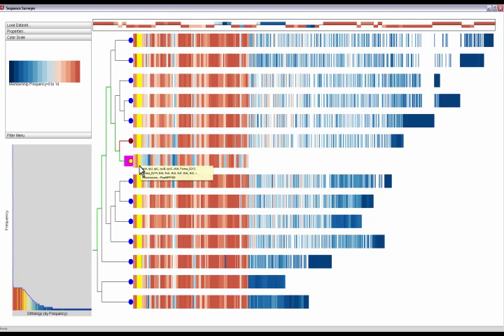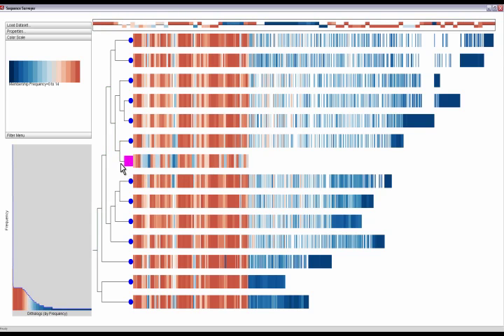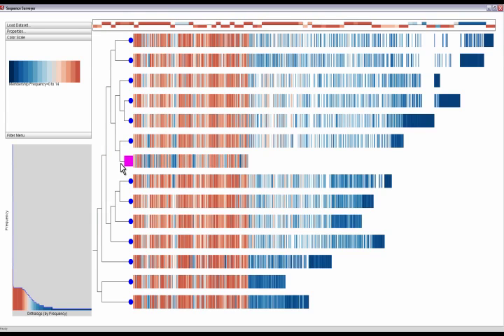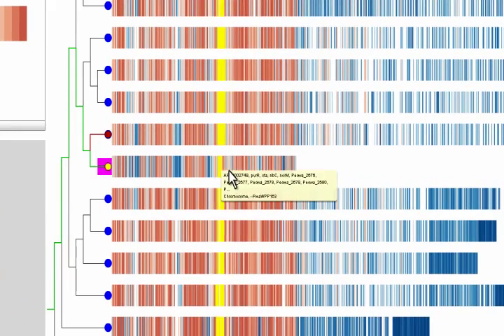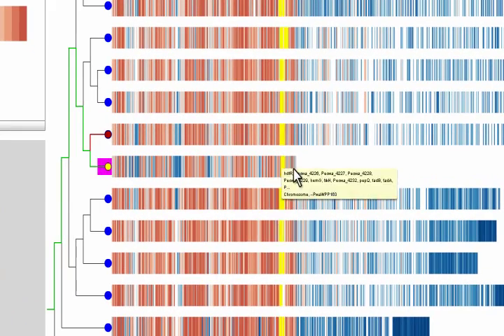Changing aggregation schemes highlights different aspects of this data. Here, robust averaging emphasizes trends. Event striping emphasizes more unique features in the data.